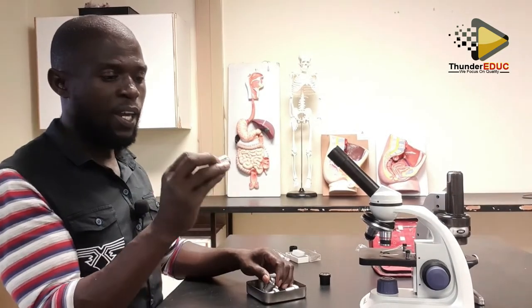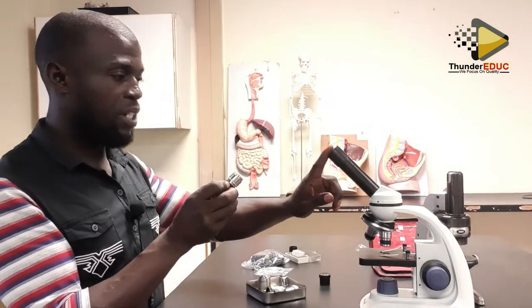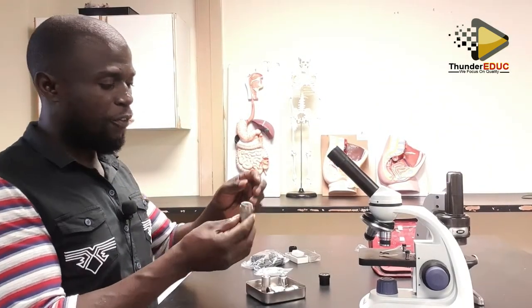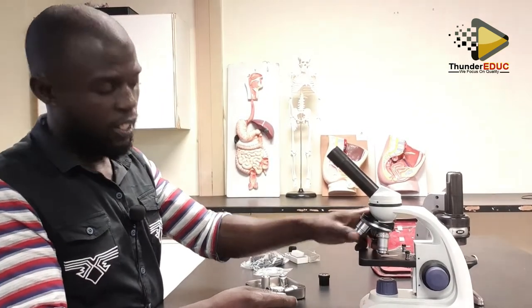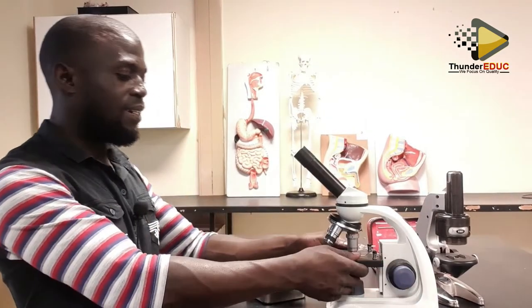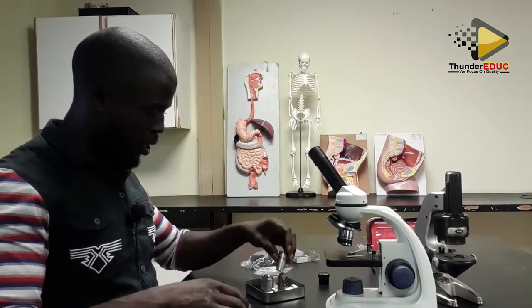If I use this one, it is times 10, so the magnification is going to be 10 times 10. The total magnification is going to become 100 times. Then if I put this other one, which is 100, and turn it to be there in the middle, it means 10 times 100 is going to be 1,000 times. So what I'm going to view here is 1,000 times. So you can change these lenses based on the kind of magnification you want. We call it the objective lens.